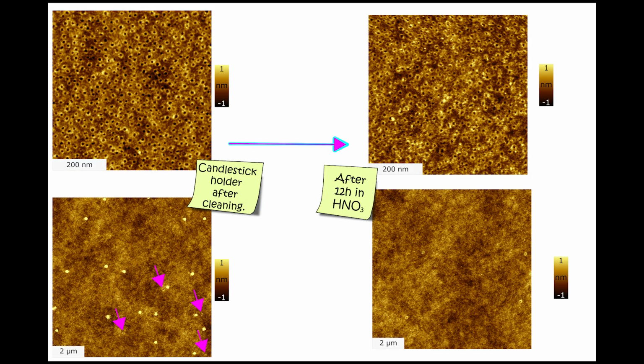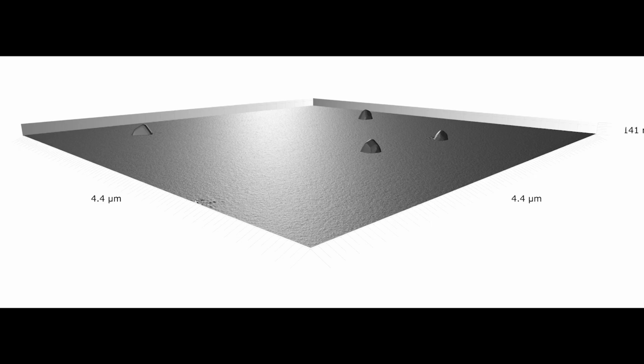Here, just to show you the different scales, if you really look closer, you should be able to see the small craters, but you also see the big calcite deposits as a comparison of the size of one against the other. And this is the flute.